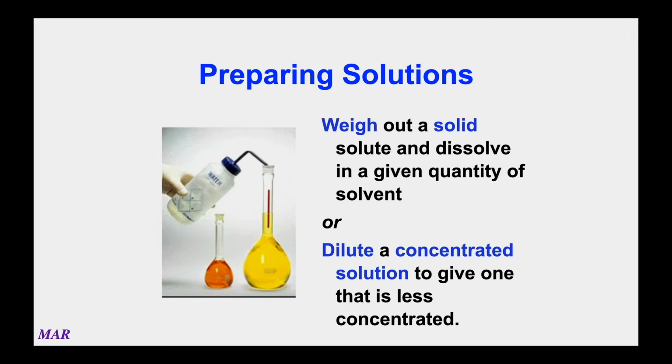We add water to the mark on the flask. After mixing thoroughly, we have exactly 500 milliliters of a solution with a concentration of 1.60 times 10 to the minus 4 moles per liter.